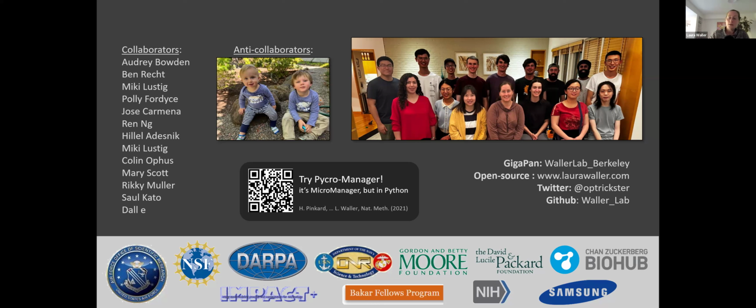And then you don't have to worry about us installing it wrong or having it poorly calibrated. So that is super useful. It just takes a little bit of extra compute. So if you can physically calibrate it, it's better.